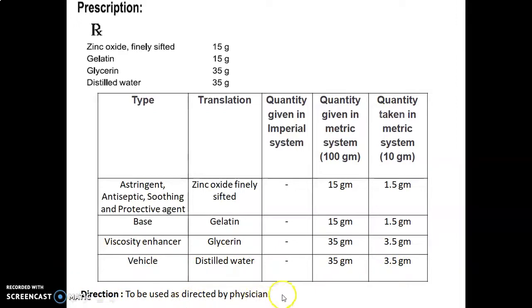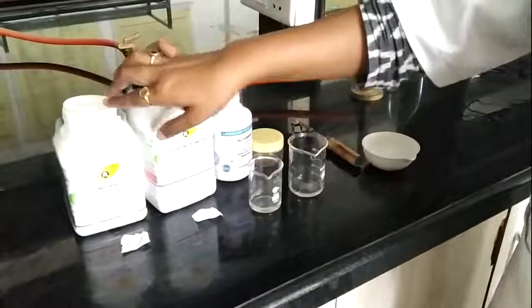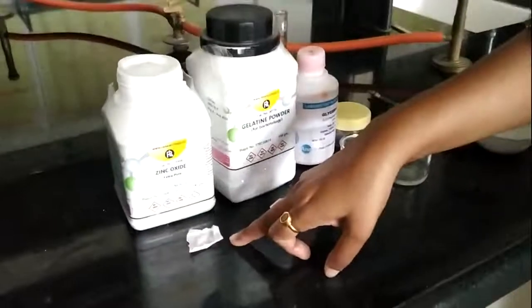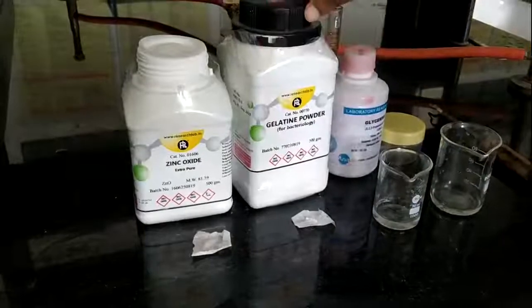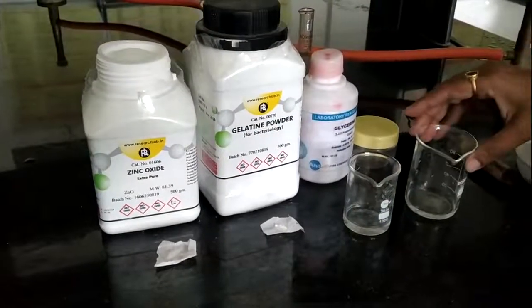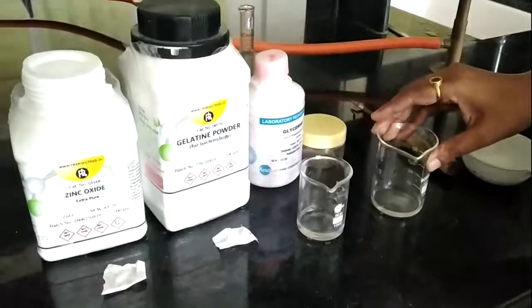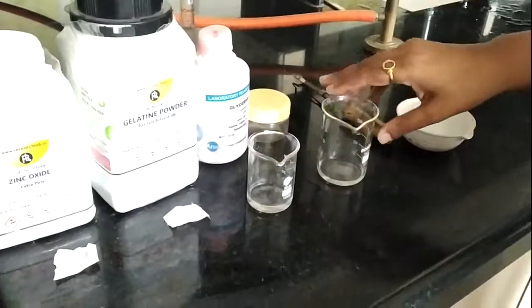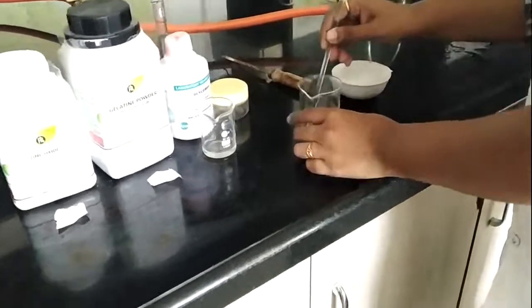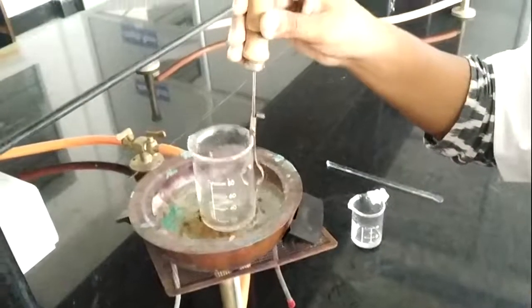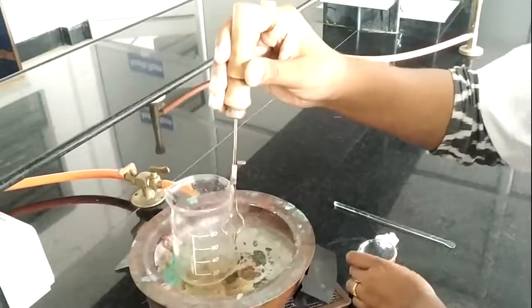Here we have zinc oxide, previously sifted through a mesh sieve of mesh size 85, gelatin powder, glycerine, and purified water. I previously heated this water, and into this heated water I am going to add the gelatin and stir it until it dissolves properly. Now I am going to add the glycerine into it.